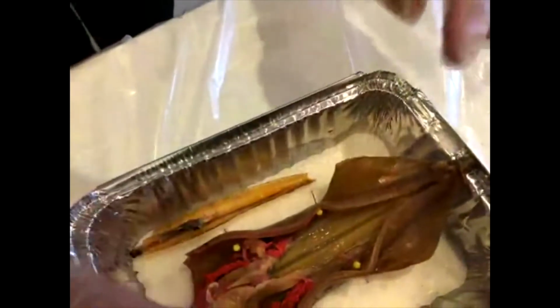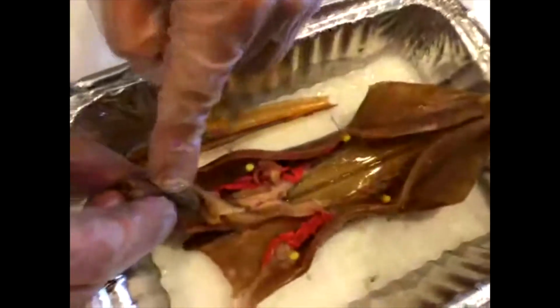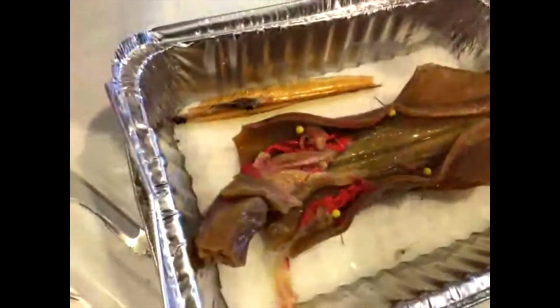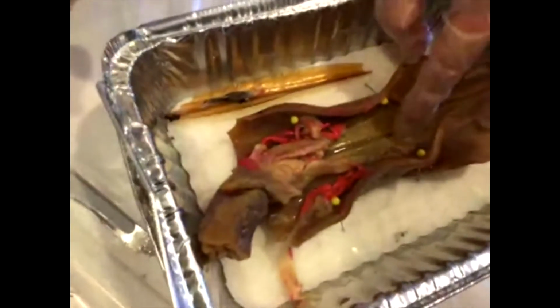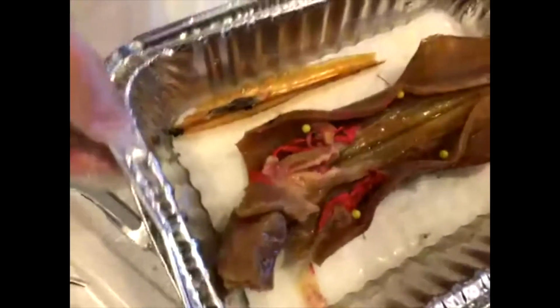Now the rest of the squid that we're not going to dissect is just the eyeballs here. And squid actually have really huge eyes. I don't know how well you guys can see that, but they have 2 dark spheres just on the sides. And they're really good at hunting, so they need those large eyes to be able to see their prey and go after them really quickly. And that's pretty much it. That's the entirety of the squid.